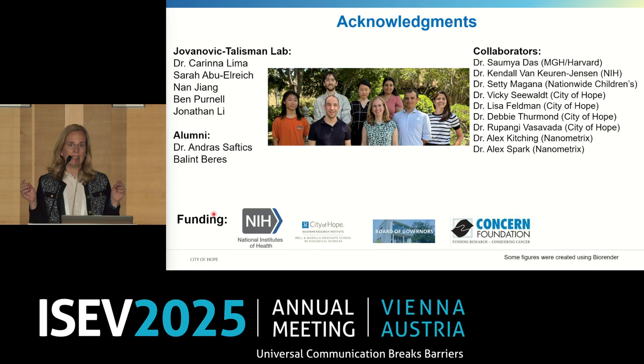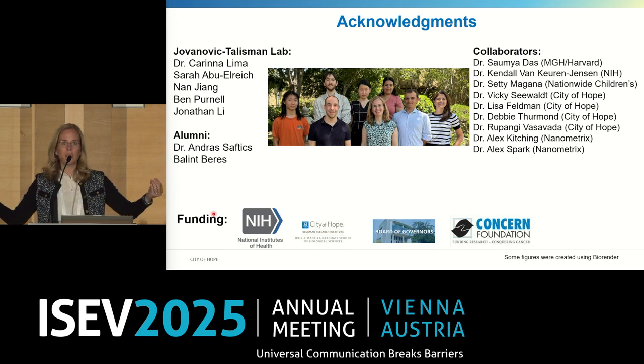Most of the techniques have a particular range of EVs they count or not. And remember, we go from 30-ish nanometers, or even 20-ish if we are considering exomeres and supermeres as non-vesicular extracellular particles, to 10 micrometers. So the range is really what I am trying to say, because if you're measuring a particular subpopulation, maybe NTA is a great technique for you, but if you have something that is really heterogeneous, then I would like to use something that has bigger range and bigger sensitivity.